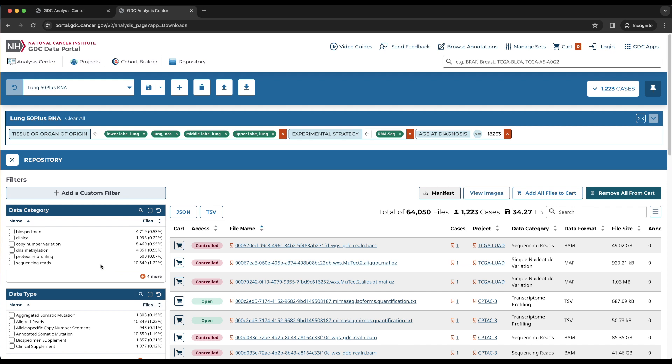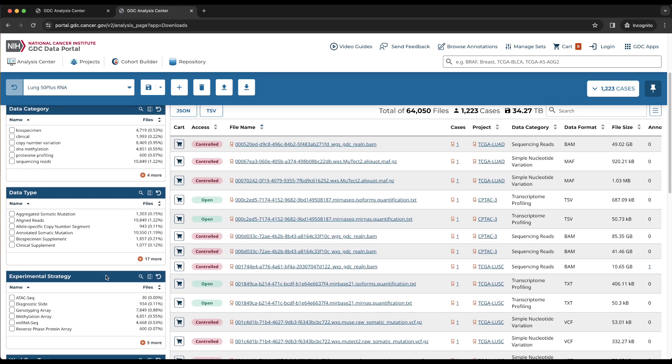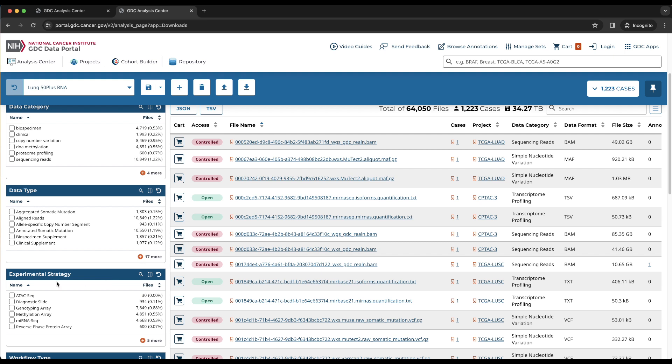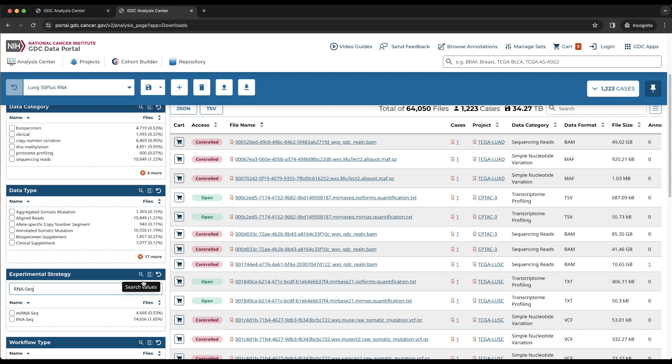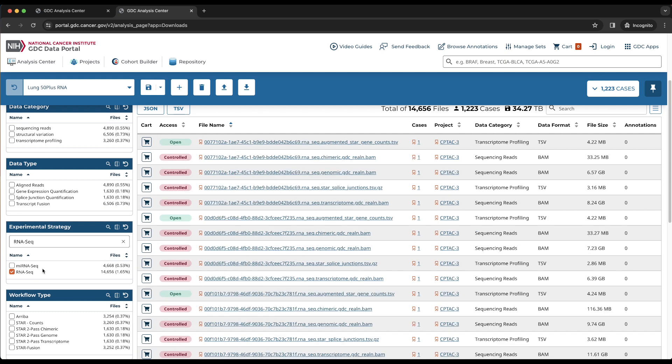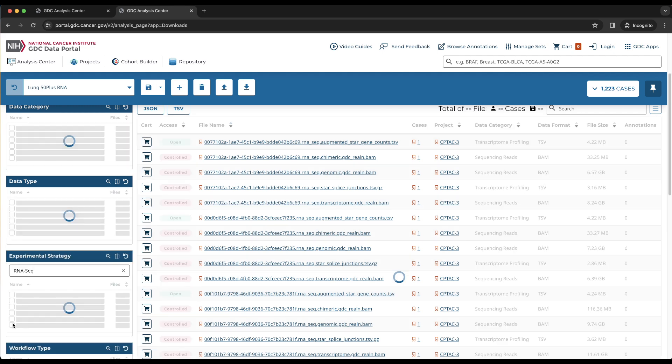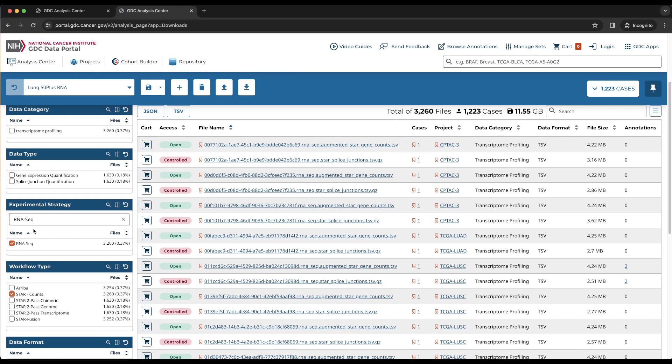Now that the filters have been reset, we would like to download the RNA-Seq gene expression count files for our cohort. For RNA-Seq files, we will use the Experimental Strategy card. Click on the magnifying glass icon to search for RNA-Seq and choose that value. To specifically download the gene expression counts file, we will select star counts under the workflow type card, and gene expression quantification under the data type card.